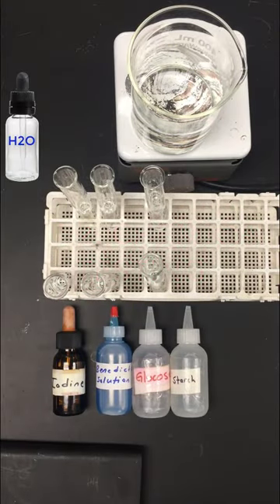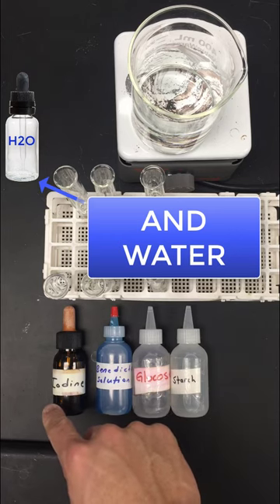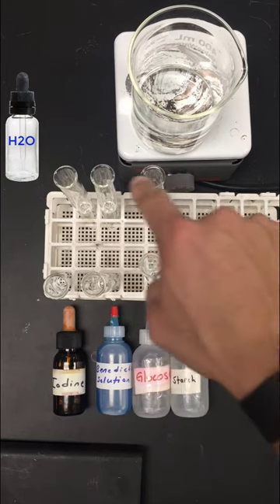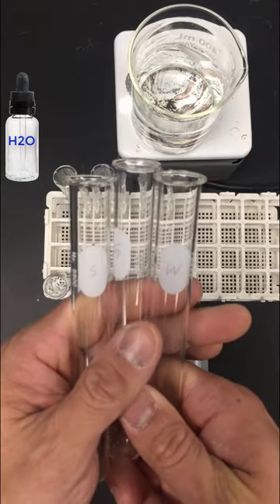These are the directions to the chemical testing portion of the diffusion through the membrane lab. You've already completed your cell and set it aside. Now it's time to check out the chemical indicators. For this station you need six test tubes and four bottles of solution: iodine, Benedict solution, glucose solution, and starch. Iodine will be the starch indicator and Benedict solution will be the glucose indicator. You'll test one row of test tubes for starch and one row for glucose.